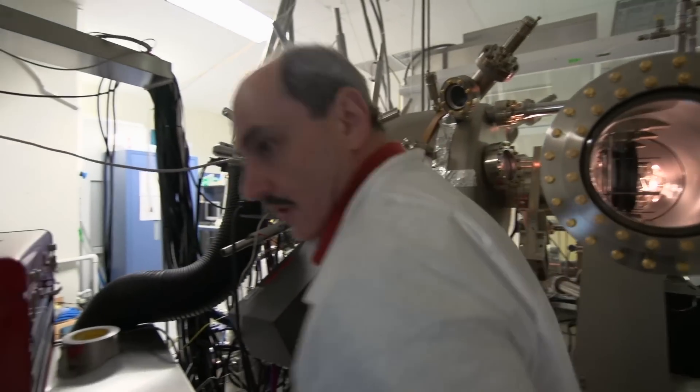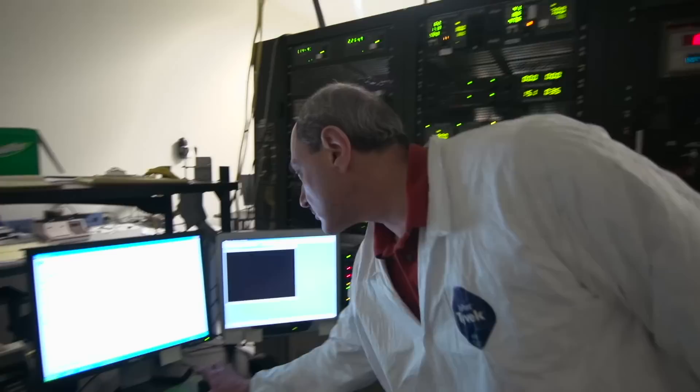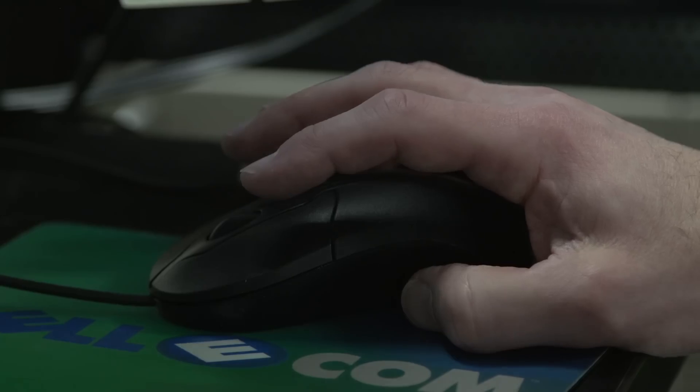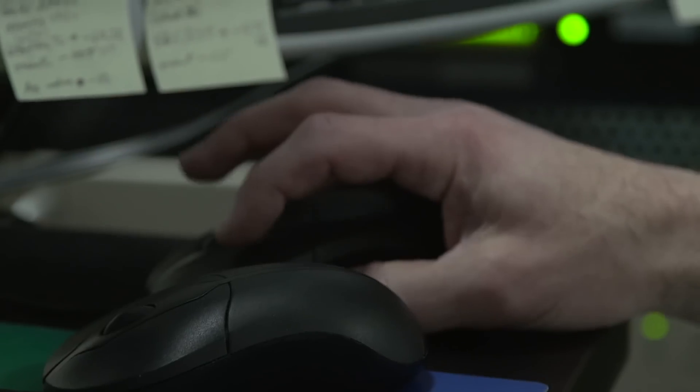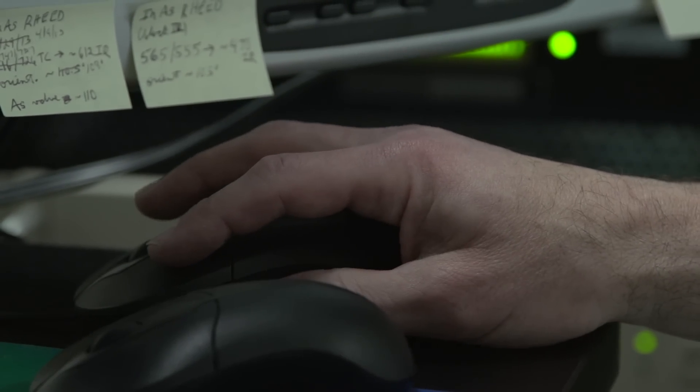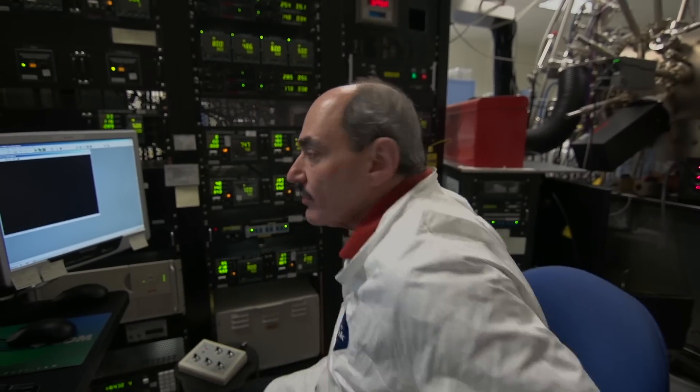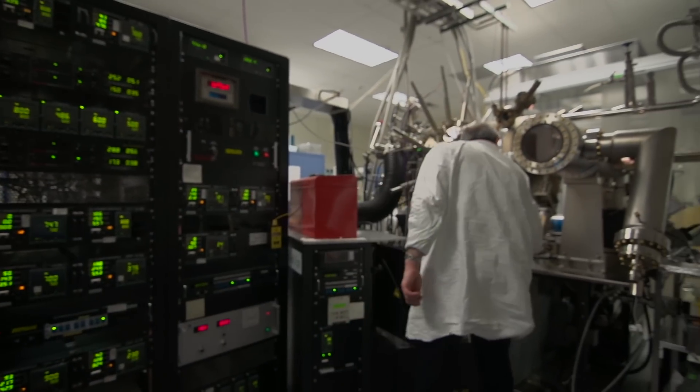If your temperature is varying by 10 or 15 degrees, your material won't be the same today as it was yesterday. By having Bandit there, it's like, 'Oh yes, the temperature's changing on me. Okay, I can make an adjustment to my thermocouple settings. I can bring it back down to where I want it.'